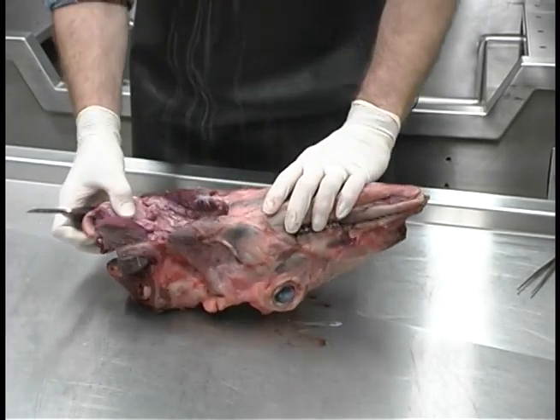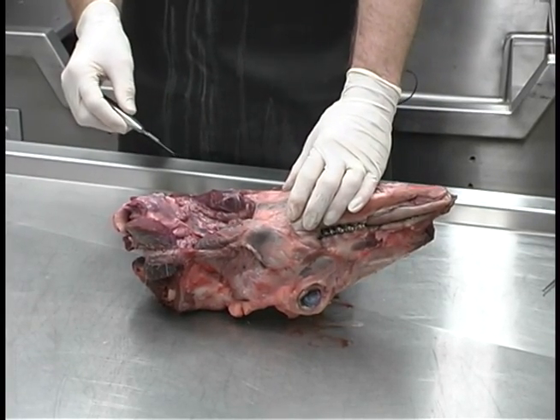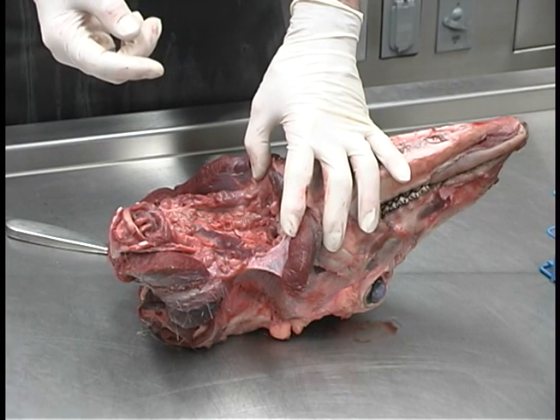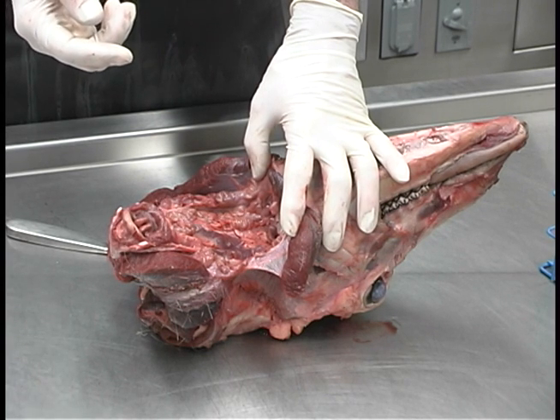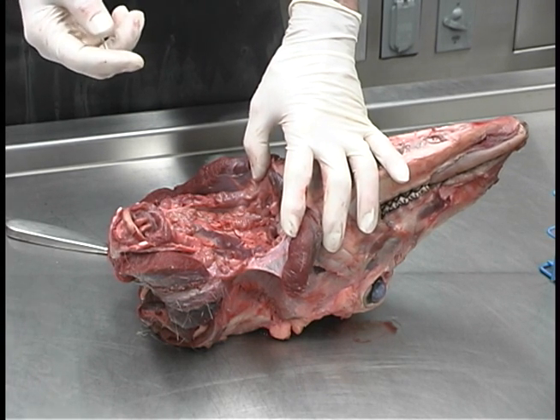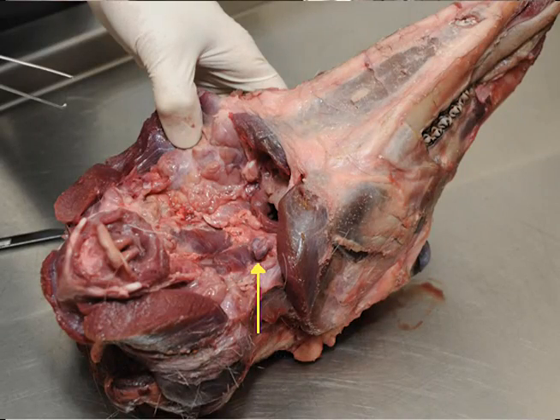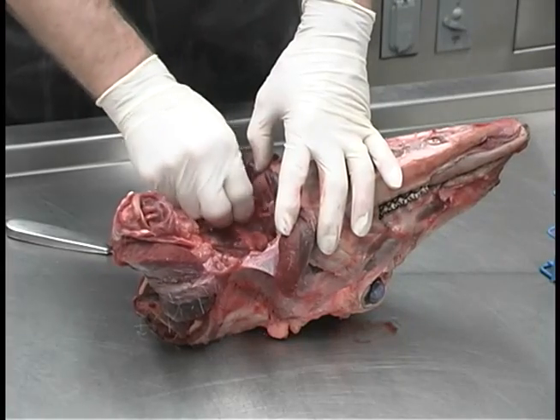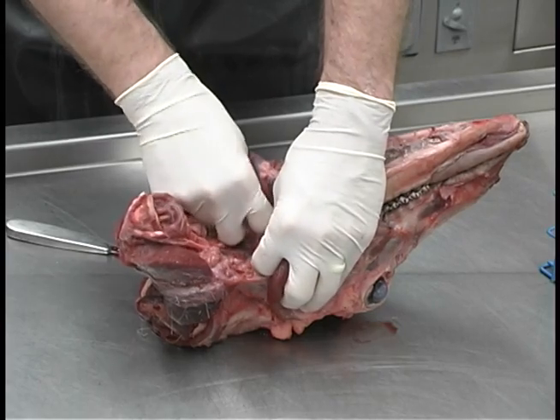We'll pull back the trachea and larynx — this will be the region where the retrofringial lymph nodes are found. The normal color can be anywhere from light to dark gray to tan, sometimes dark pink or even dark red depending on if the animal's been frozen or thawed a couple of times. Here you can see one of them — we got lucky, it popped up right here. They're also much firmer than the surrounding tissue, so if you don't see them right away you can dig your fingers in and feel around for them.